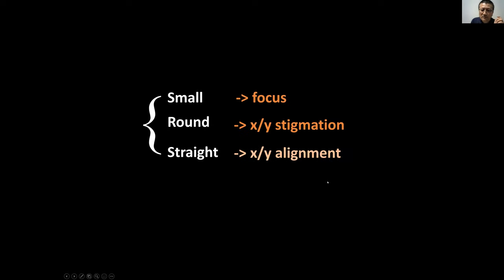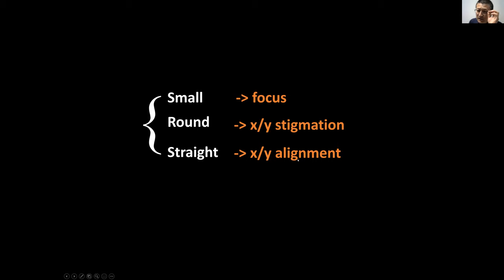When the image shifts as you change focus, you use the X-Y alignment knobs to shift the aperture back to the correct location. Then change focus again — if the image no longer moves, your aperture is aligned. So in summary: we want a small beam, a round beam, and a straight beam. When you change focus, if the image changes shape, you have an astigmatism problem. If the image position changes, you have an alignment problem. Correct stigmation using X-Y stigmation knobs, correct alignment using X-Y alignment knobs, then focus again.